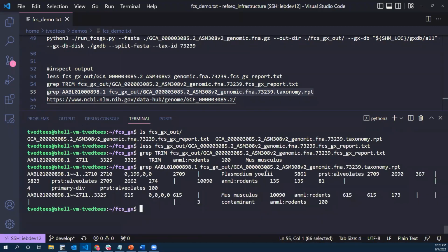for this particular sequence. The way that this taxonomy report file is organized is it has some summary information in the first few columns about the sequence size, any repeats identified, and the length of regions matching any of the top 4 hits.